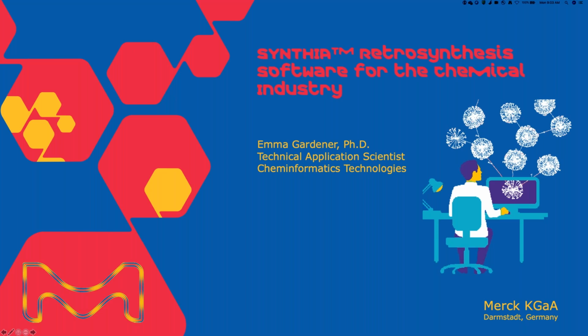Great, thanks, Ben, and thanks for having me. We're really excited today to be able to show you Synthia, our retrosynthesis tool, and how you can use it in your research in the chemical industry.